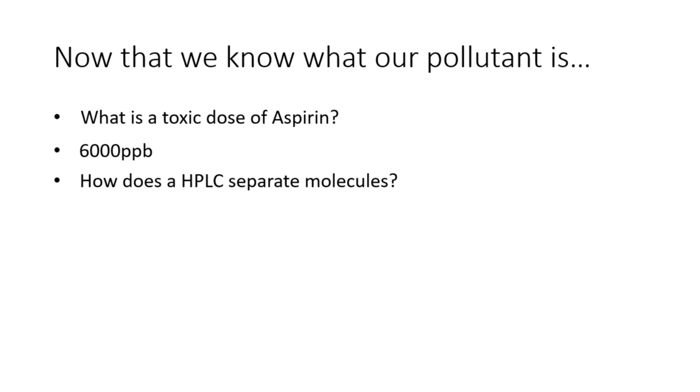So a HPLC actually has a few methods of separation. In our case, we're using something called a non-polar stationary phase. I'm assuming everybody knows what polarity of molecules is. It essentially means that more non-polar molecules will want to stick to the stationary phase so they don't get dragged along with the polar mobile phase.